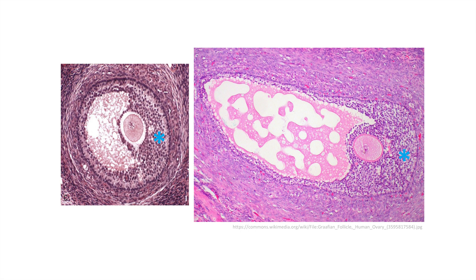When mature or Graafian, the follicles show a large cystic space with a stalk connecting the egg back to the edge of the follicle, known as the cumulus oophorus, noted at the blue asterisk in these photos.